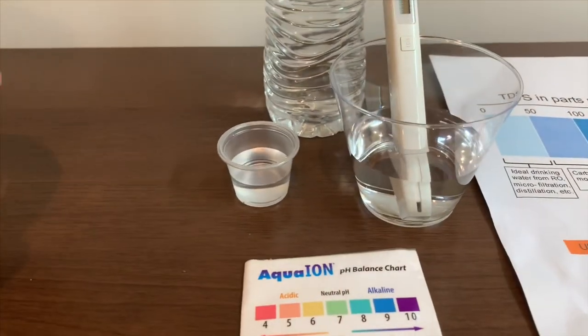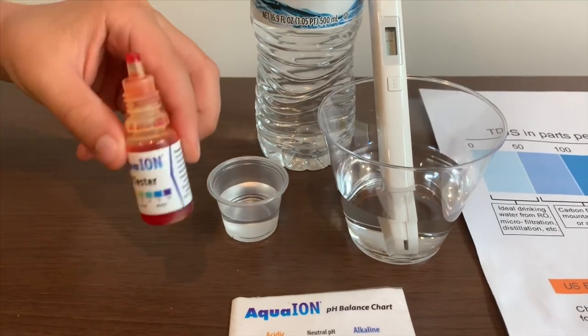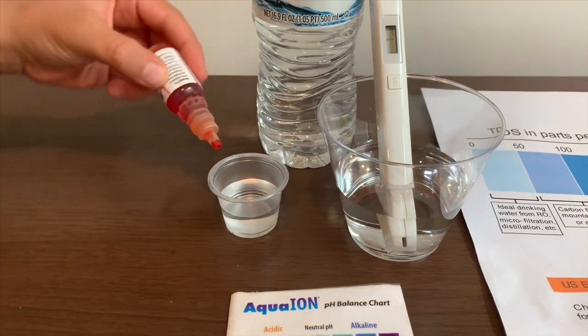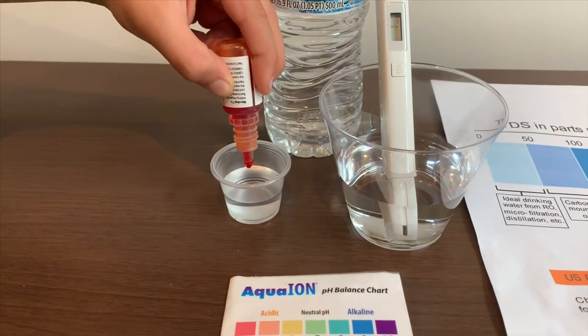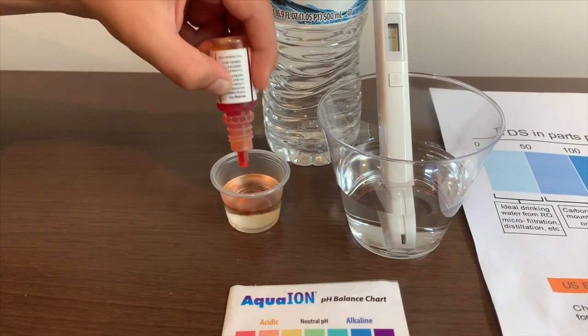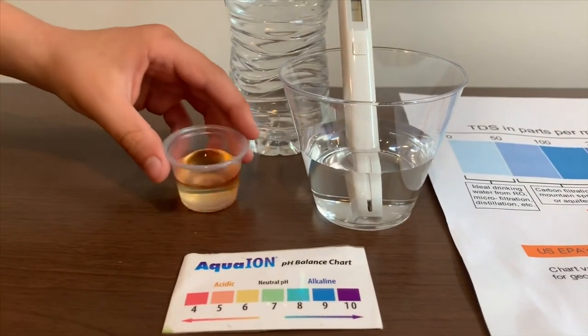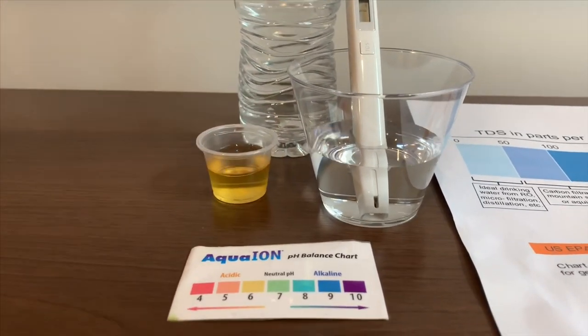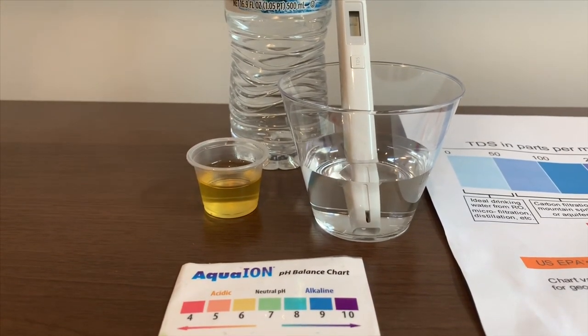Now let's test the pH level. If you want to buy this pH tester, check the link down below. Only do 2 drops. Let's stir it a little for a better result. And this is 6 — this is acidic.